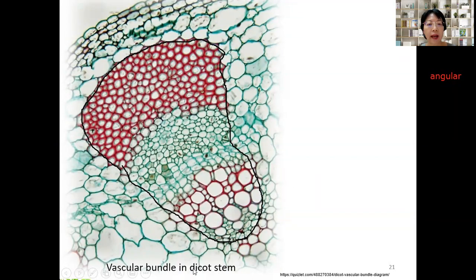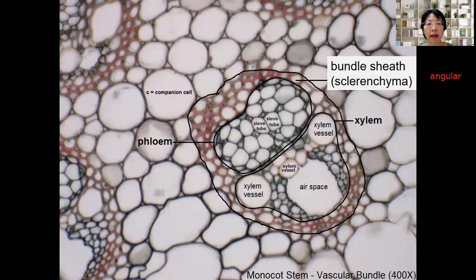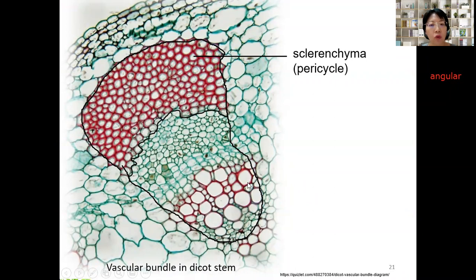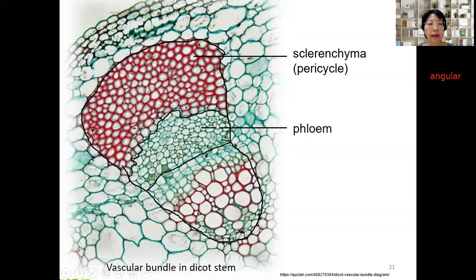This is another vascular bundle — this time in a dicot stem. Dicot and monocot stems are slightly different in the arrangement of xylem and phloem. The cells on top here all have lignified walls and are quite small versus this larger cell which also contains lignified wall. The small ones are sclerenchyma cells, so this layer is sclerenchyma tissue, also called pericycle. You need to draw the borderline to distinguish sclerenchyma from other tissue based on cell differences — look for the borderline between sclerenchyma and neighboring cells without lignified walls.